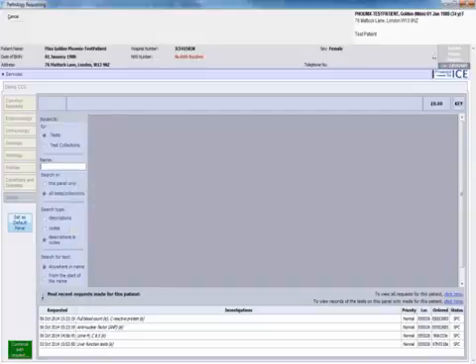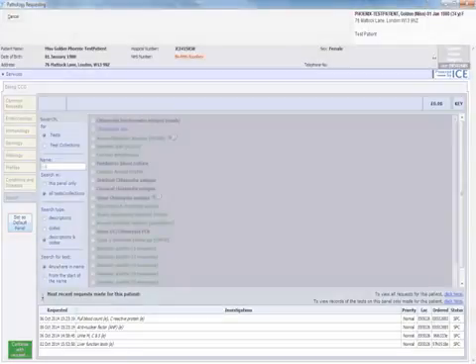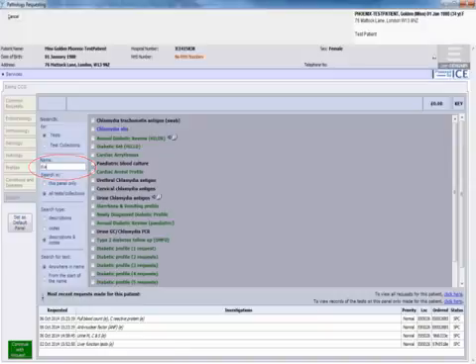When using this search functionality, it may take a little longer than usual to bring back your results, as the entire system is searched for the required letters or phrase. We entered the letters DIA, and many hundreds of results have been returned.